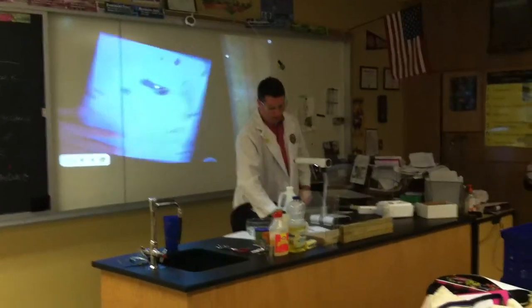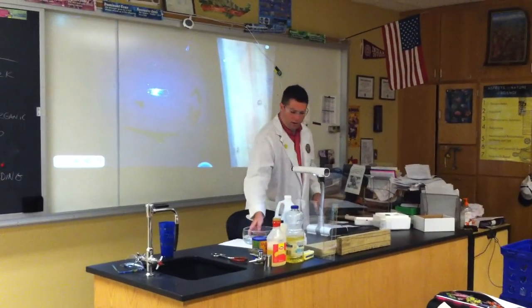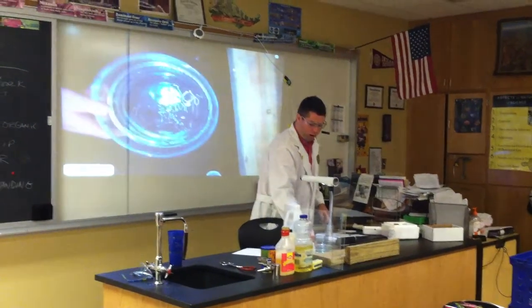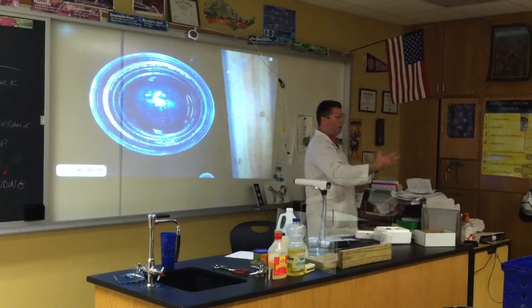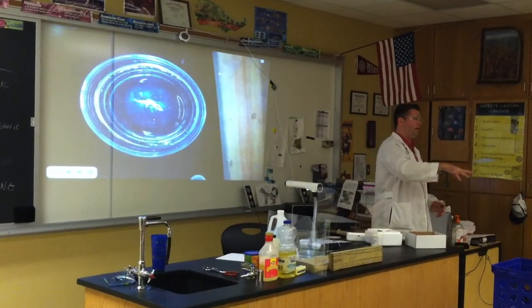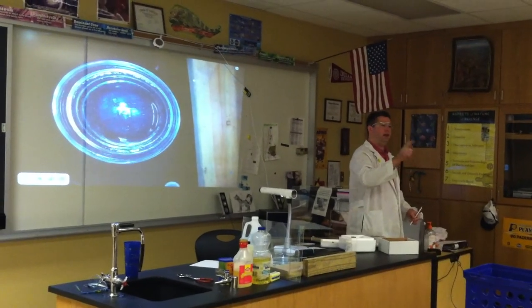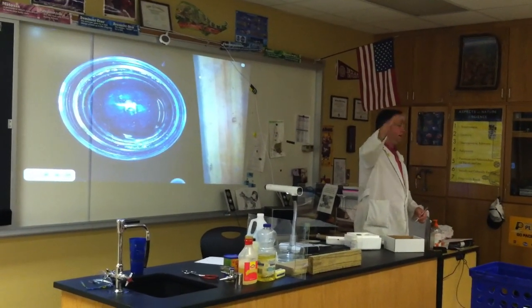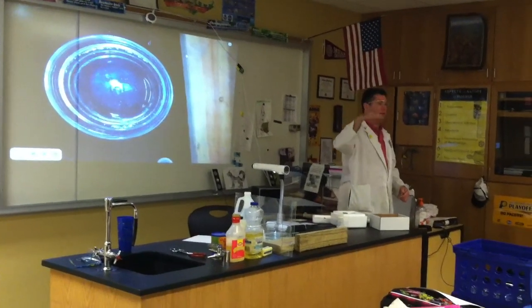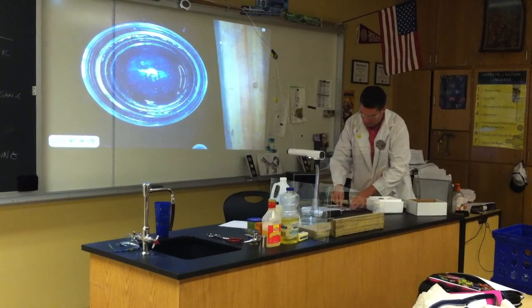So we're going to take a look at what this does with some water now. When it reacts with the water, remember this has one valence electron. It wants to get rid of it. And anytime electrons move, we have energy, right? Like electricity. Electricity is all just electrons moving through wires. That's what gives it power. So the same thing here, we're going to see what happens when the electrons move.